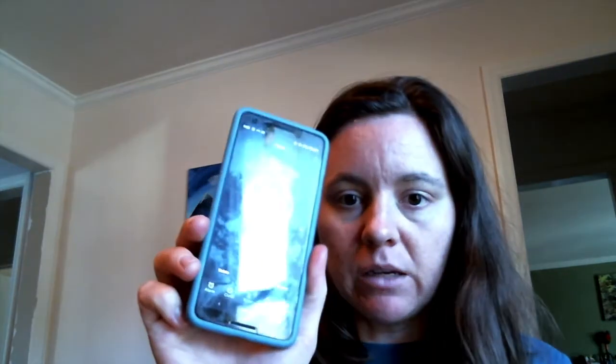test completes. All right, so I'm going to set myself a timer for 2 minutes and I'm going to keep inverting it and keeping it covered while that tablet dissolves, and then I will set it for 5 minutes and just let it sit covered up.